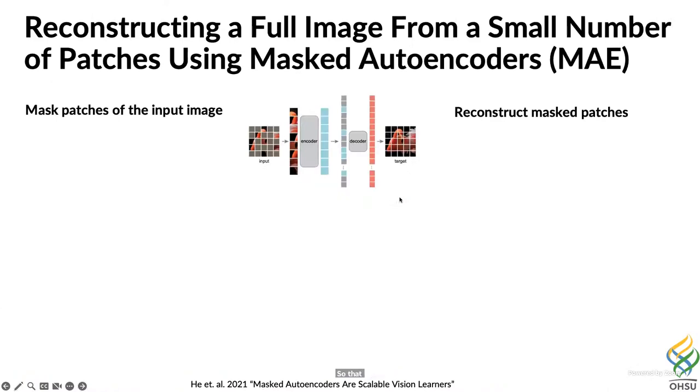The framework through which we implement our panel reduction and marker imputation process is a clever implementation of the masked autoencoder. We've talked a lot over the past couple of days about masked language models, and the masked autoencoder is the extension of masked token prediction to images. The two key differences are that we use an encoder-decoder framework where the encoder only sees the visible image patches, and the decoder then takes the latent representations of those visible patches along with the mask tokens, and uses them to regenerate the missing patches.